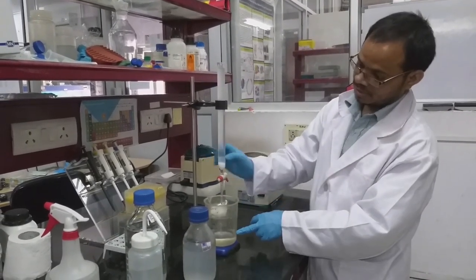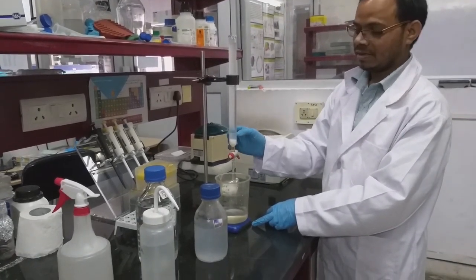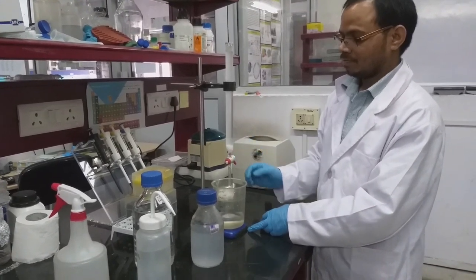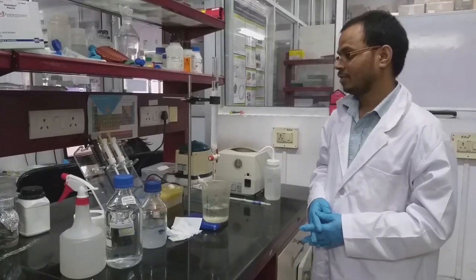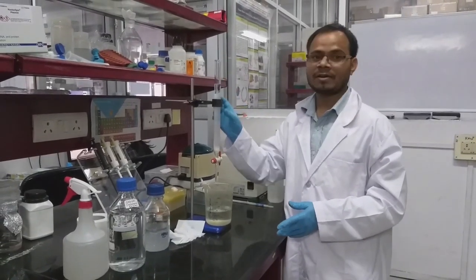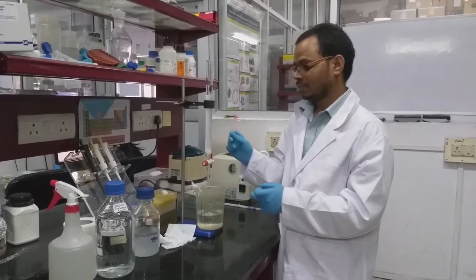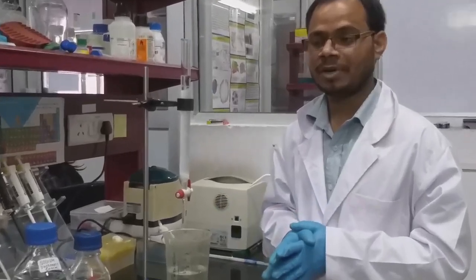The beads are settling. As we can see, the beads are settling properly at the bottom of the column. Now, as you can see, we packed the column properly. So now the next step is we have to load the sample.